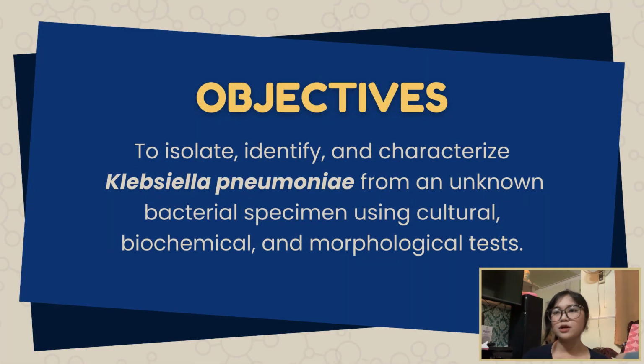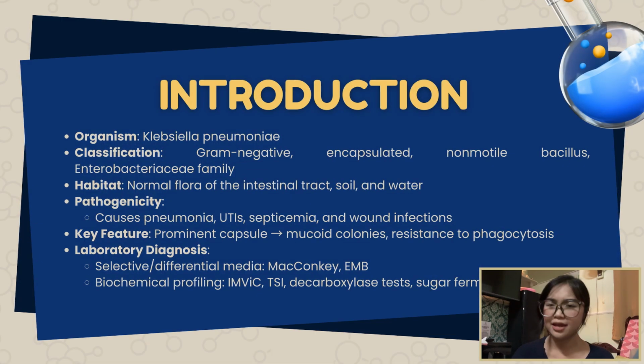The main goal of this experiment was to isolate, characterize, and identify Klebsiella pneumoniae through microscopic observation, cultural characteristics, and biochemical testing. Klebsiella pneumoniae is a gram-negative, encapsulated, and non-motile bacillus that belongs to the Enterobacteriaceae family. It is part of the normal intestinal flora, but it can become pathogenic, causing pneumonia, urinary tract infections, septicemia, and wound infections.